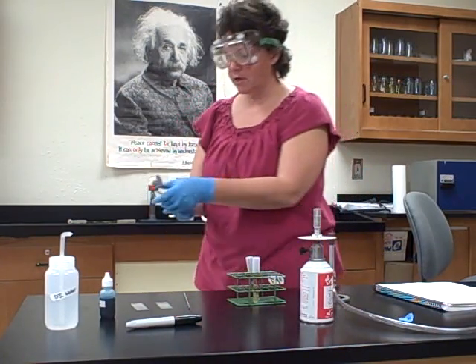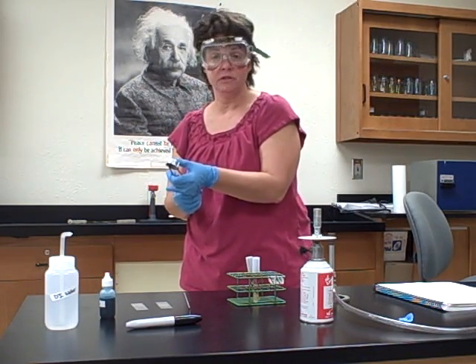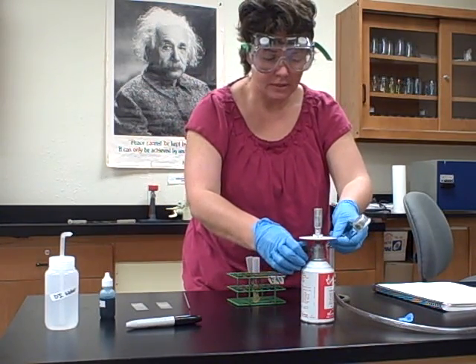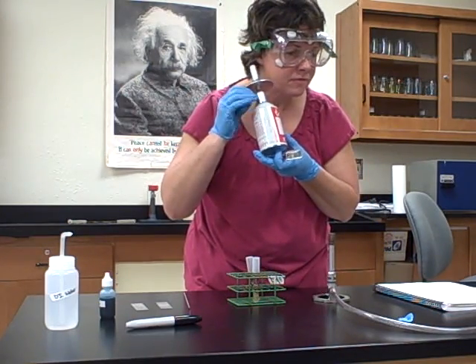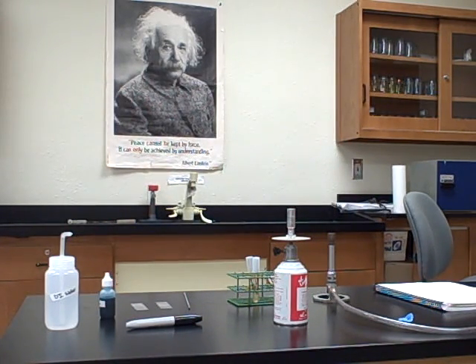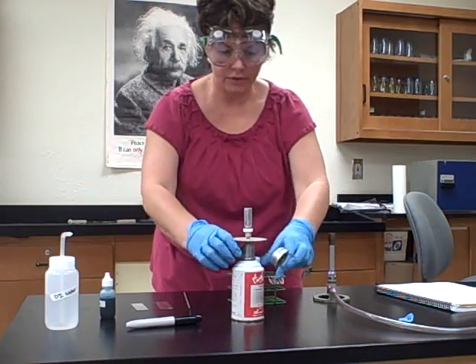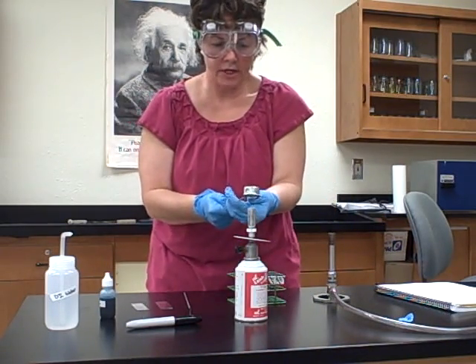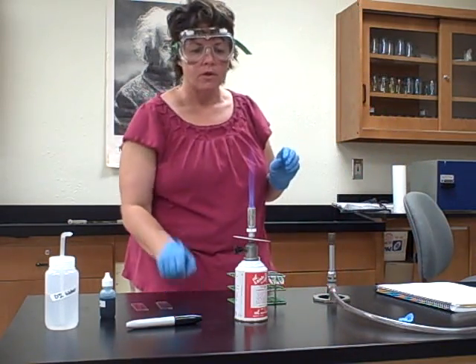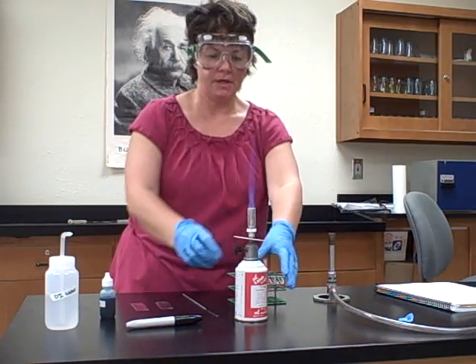You want to make sure your striker works — just look for a spark. If you don't get a spark, sometimes putting your finger on the back helps add pressure for a better spark. We're going to turn the gas on until we hear it. Unfortunately this one might be empty, so I'll go get another one. Turn it on until you hear the gas coming out, then strike it and you'll have a flame.